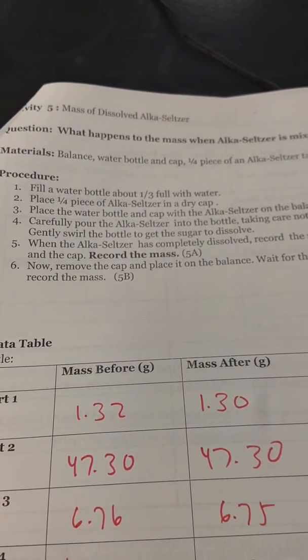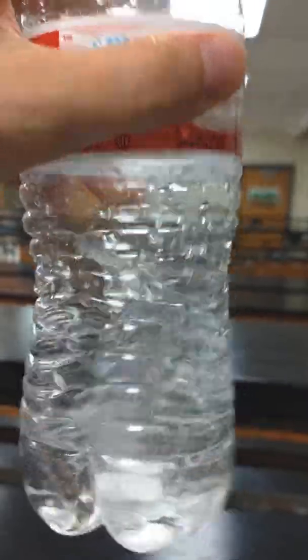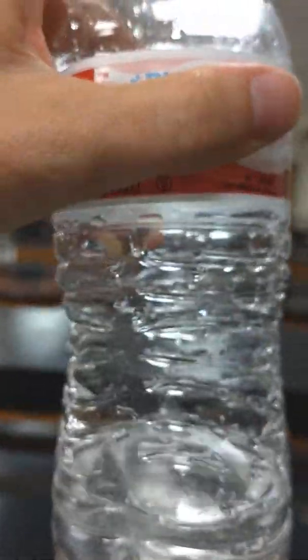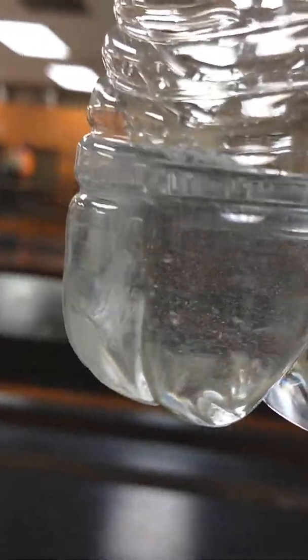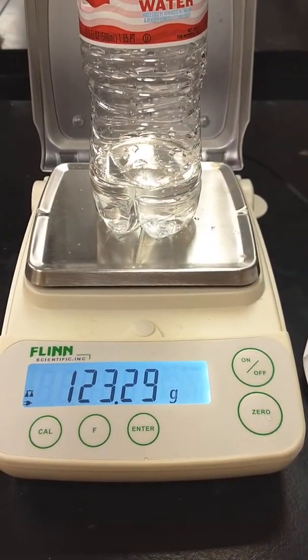Now I'm supposed to add the Alka-Seltzer to the water, cap it, and then put it back on the scale. I thought you'd like to see the Alka-Seltzer in the water — see it going? I can shake it up a little, but I want that to react. I'll come back when it's completely done. It's done reacting, so now I'm going to put it on the scale. Go ahead and record that.